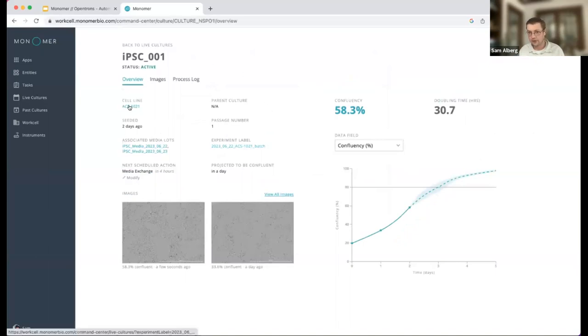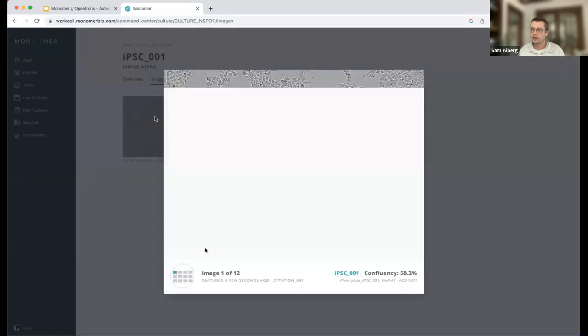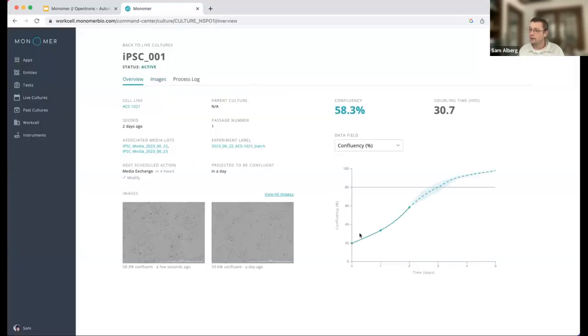And if I click back into this particular well, now you'll see that I have three sets of images. I've imaged these once a day for the last 3 days. On my overview, I now am superimposing my real growth curve, and I can just view the growth progress of this particular culture.